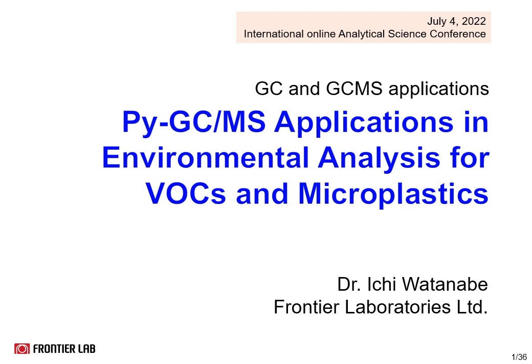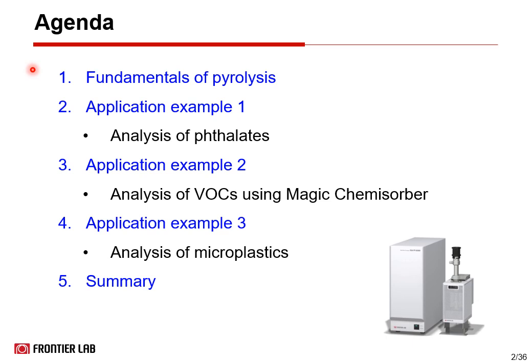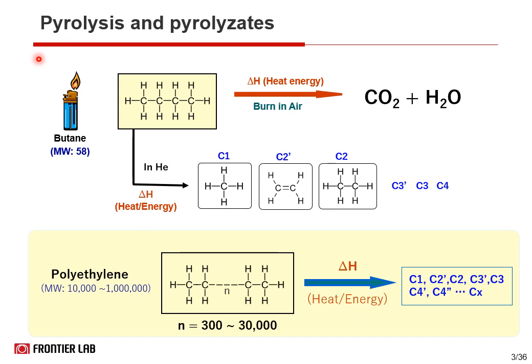Today, I will give you a talk about Py-GCMS applications in environmental analysis for VOCs and microplastics. Here is today's agenda. I start with a brief explanation of the fundamentals of pyrolysis, then talk about different applications using Py-GCMS system. So throughout this talk, you will find out the wide applicability of the pyrolysis techniques to environmental samples.